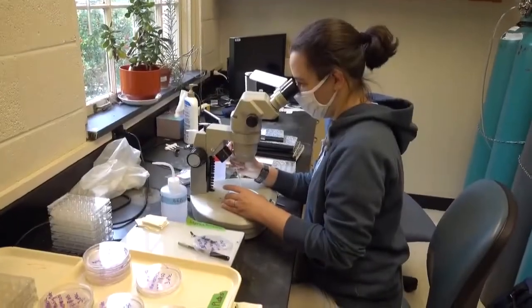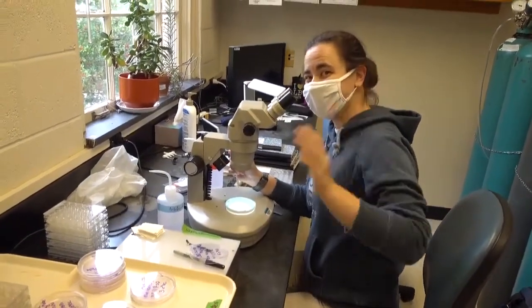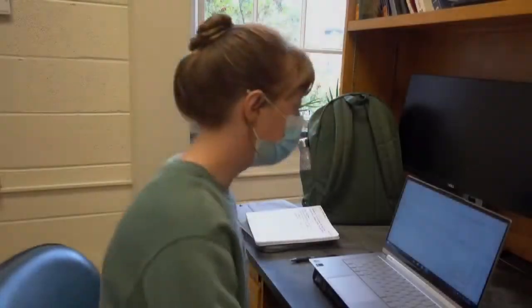By this time, one of my lab mates had come in, so I just took a break to stop by and say hi to Amy, who is working on her own research at a microscope.